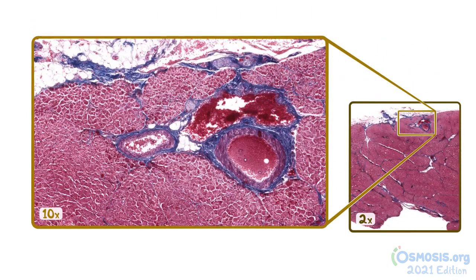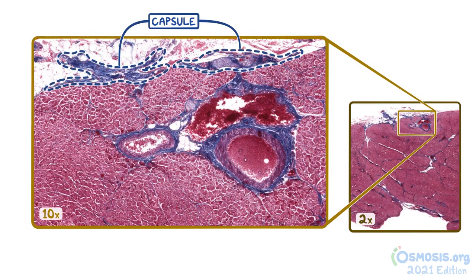The pancreas has a thin collagenous capsule that surrounds the entire pancreas, although only portions of it can be seen in this image. The capsule also extends into the pancreas as septa, forming lobules.